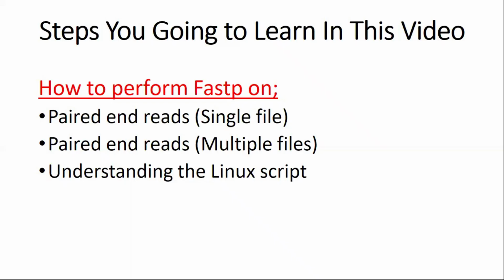Again, we will perform these types of tasks, so it will be completely coding based. So let's start with the practical, and inshallah you will learn a lot from it.